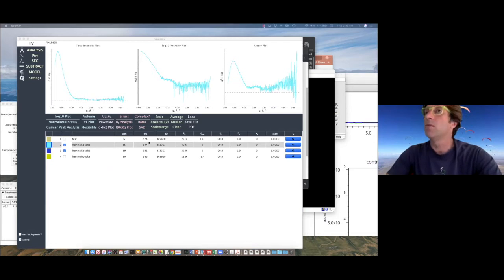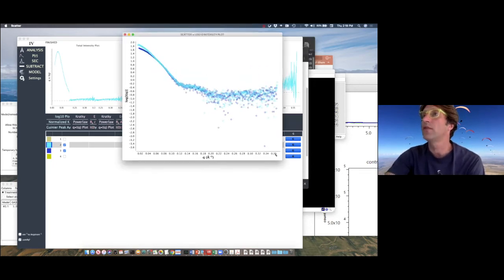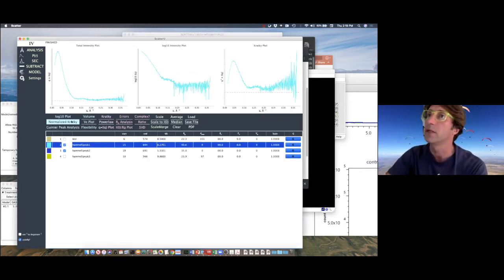You can look at the moles, and you will see that peak 1, the cyan, versus blue, peak 2, have different molecular weights. It's 110 versus 170 kilodalton. And when you calculate the PDDF, let's go step by step and look at the normalized Kratky plot.